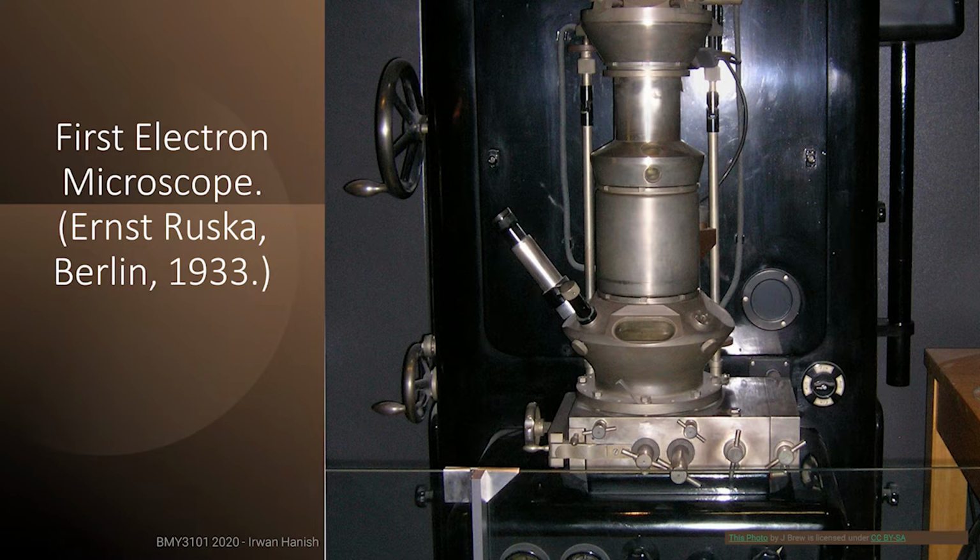As I mentioned in the first part of this lecture, the electron microscope was invented by the Hungarians and Germans. You can still see the replica of the first electron microscope in Deutsches Museum in Munich. It's beautiful in the classical sense, with the needle meter to show the voltage instead of a digital screen, and they have a wheel controller that you have to turn by hand, because this was before the advent of the modern computer. It reminds me of the scenes in Captain America, the first Avenger.